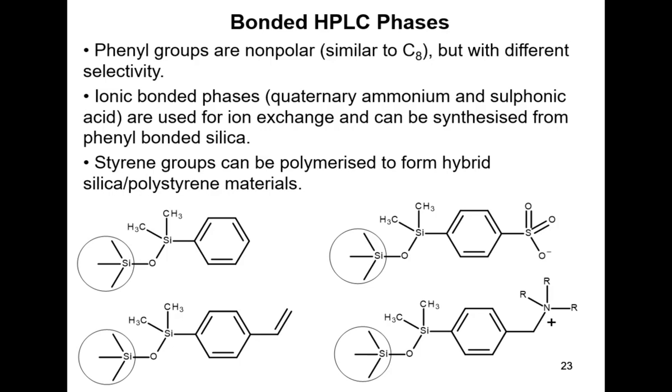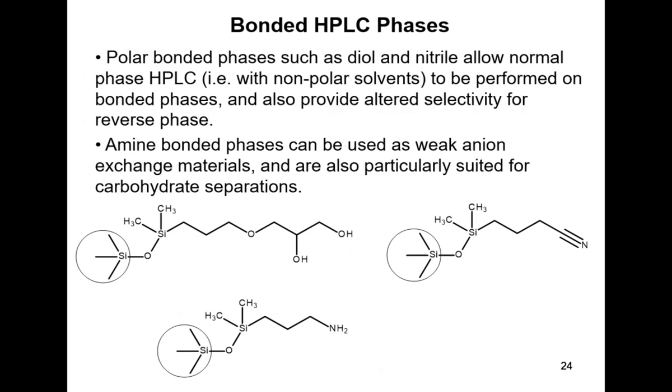But if it's attached to a silica particle, then that's a much stronger, harder core material, and you can have this thin layer of polystyrene on the outside. So you have a particle which is behaving like polystyrene, but can cope with much higher pressures. It's not terribly common though.